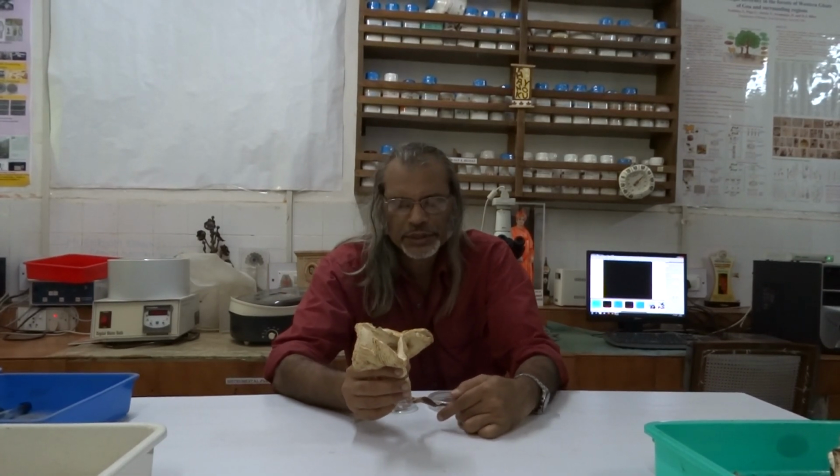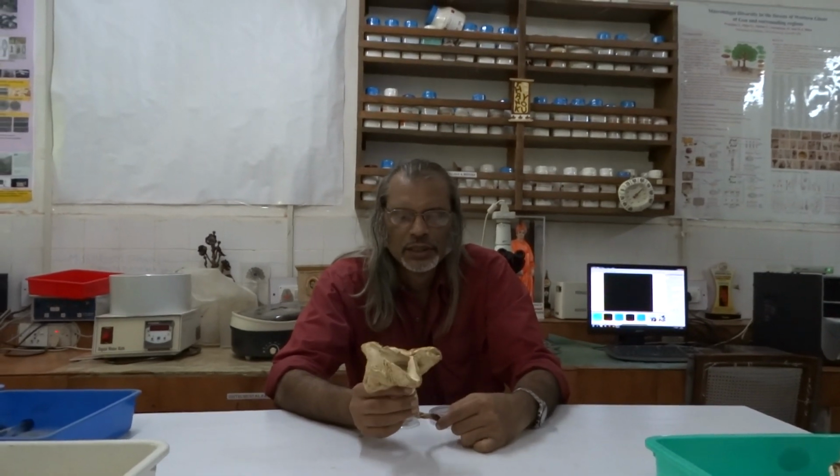But here it is possible to bring them and examine them in the lab within a few hours, and taking advantage of this opportunity, we want to record certain important aspects in this video clip regarding some ideas on species plasticity in genus Termitomyces.